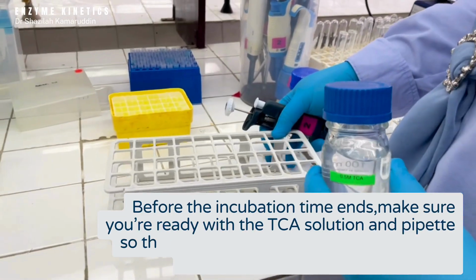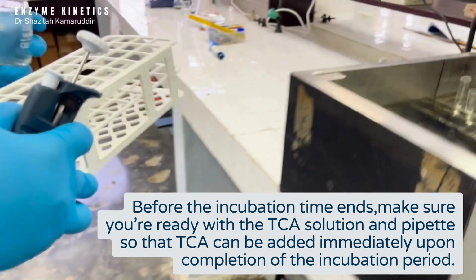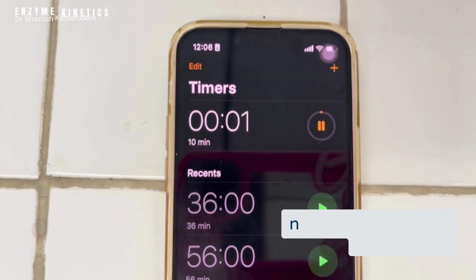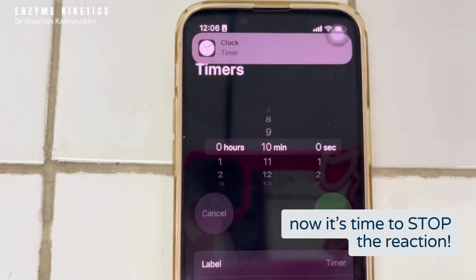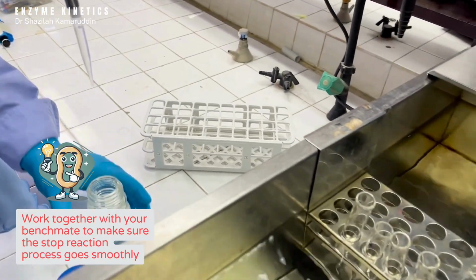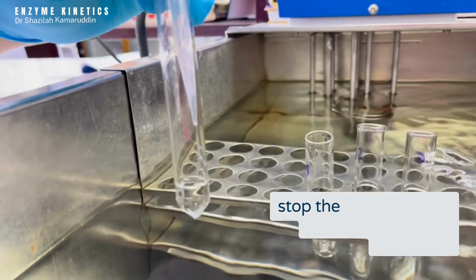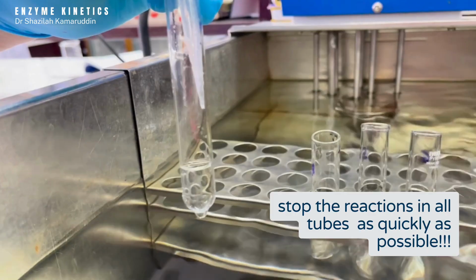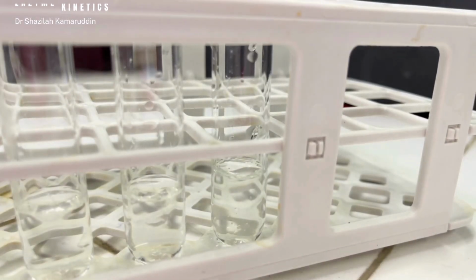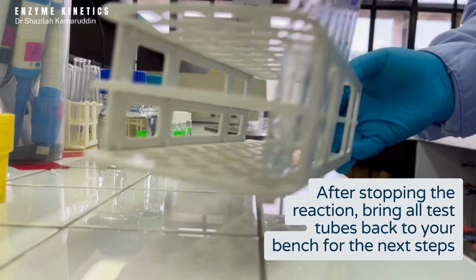Before the incubation time ends, make sure you're ready with the TCA solution and pipette so that TCA can be added immediately upon completion of the incubation period. Make sure you stop the reactions in all tubes as quickly as possible. After stopping the reaction, bring all test tubes back to your bench for the next steps.